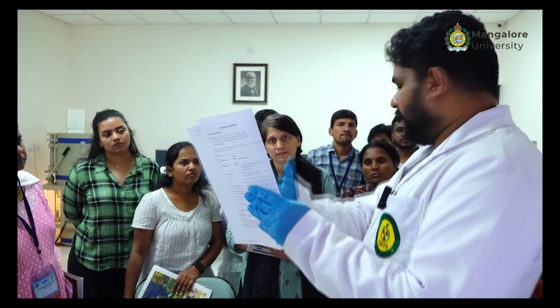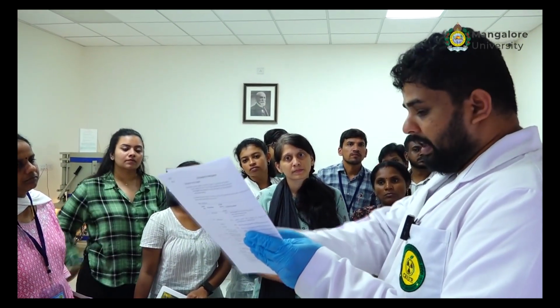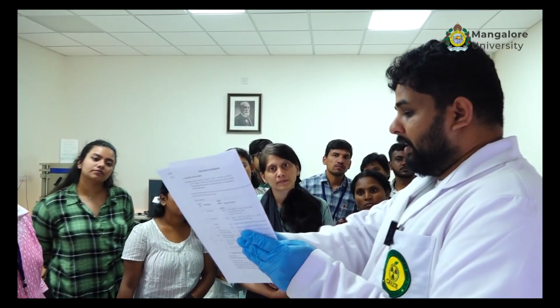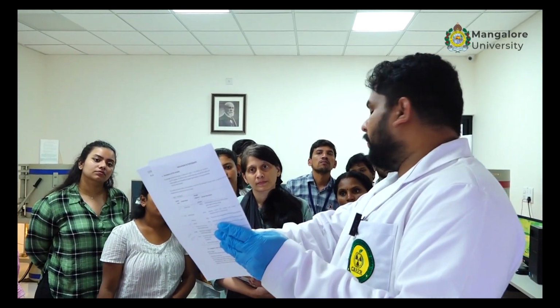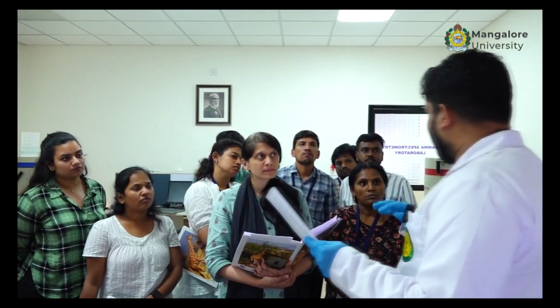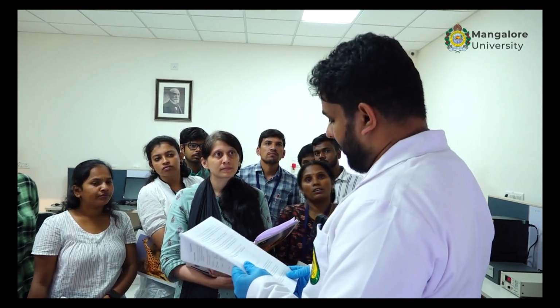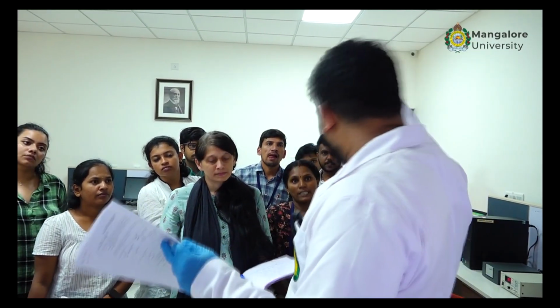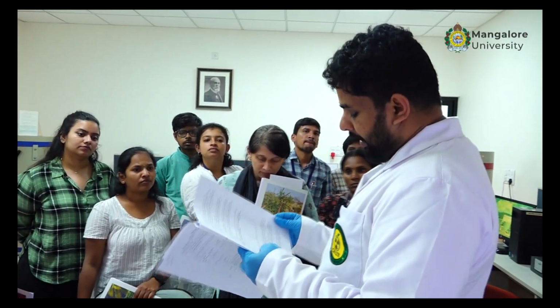So in this, whichever is applicable to us, we have to take, they have given the activity concentration in becquerel per kg, and they have given us a reference date. So the reference date over here is 2024-11. So from the counting date, we have to back calculate and find out the activity from that date to the calculated date.